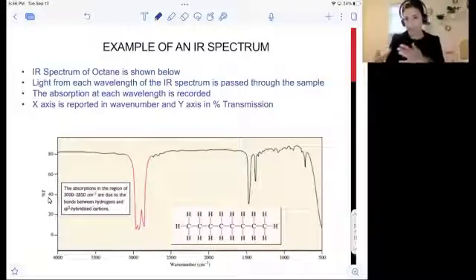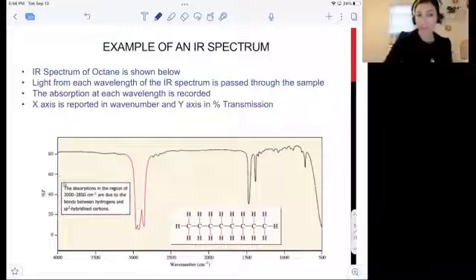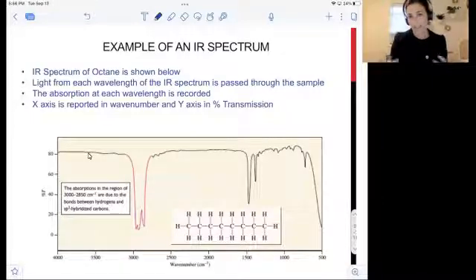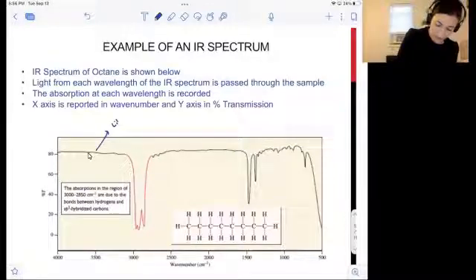If we think about our fundamental principle of spectroscopy, we have an incident or incoming light, which is then exposed to our sample. We know the light that came in, and we can measure how much of that light has passed through. At high transmission, we have these flat areas that are higher on the y-axis. That indicates that at that particular energy, there was no absorption by our molecule. So this is little to no absorption.